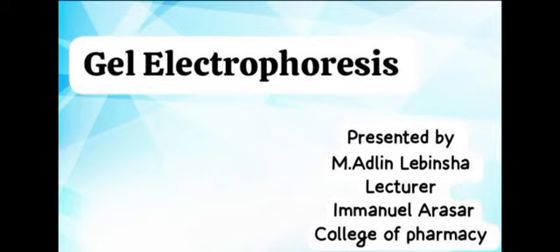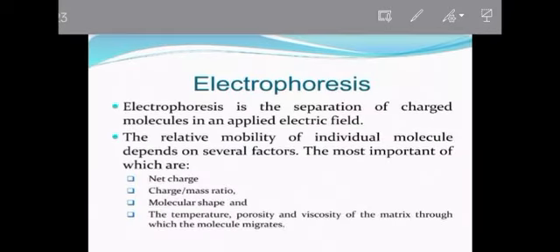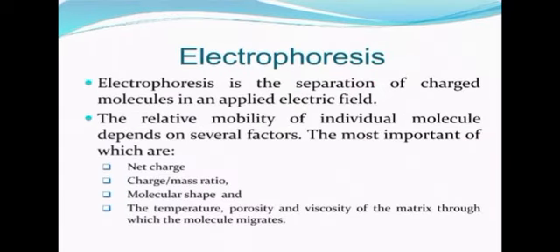Today's topic is gel electrophoresis. It is one of the types of electrophoresis. First we see the introduction to electrophoresis. We already saw paper electrophoresis. Once again we see the electrophoresis definition.